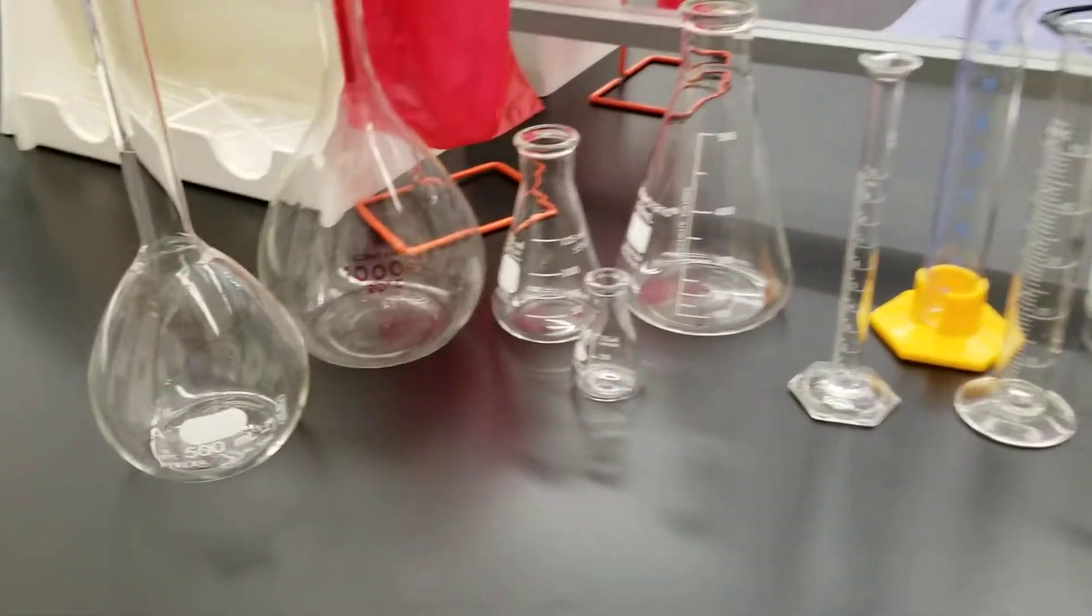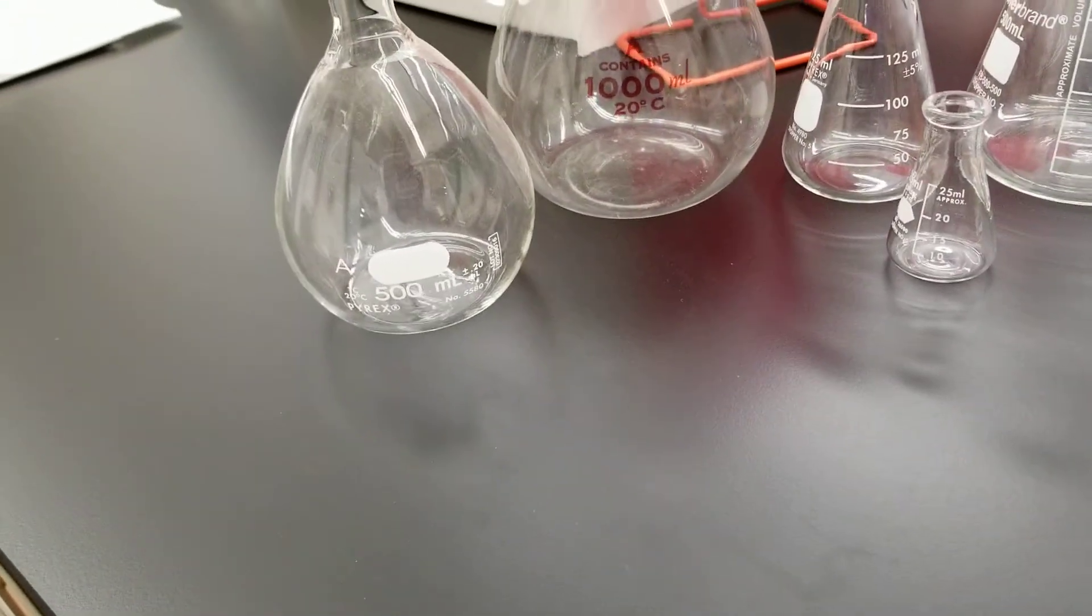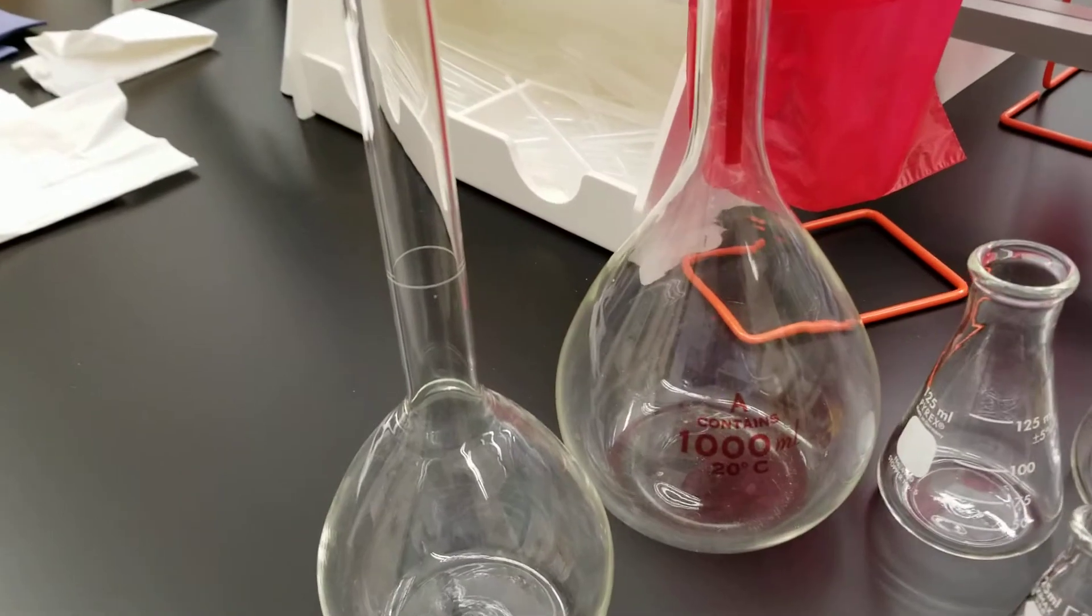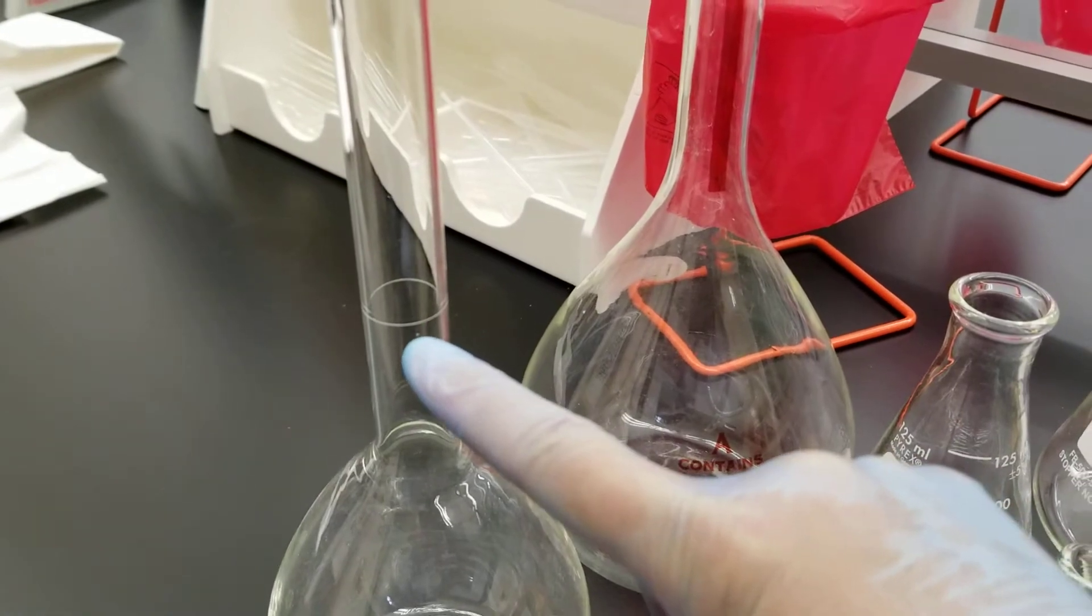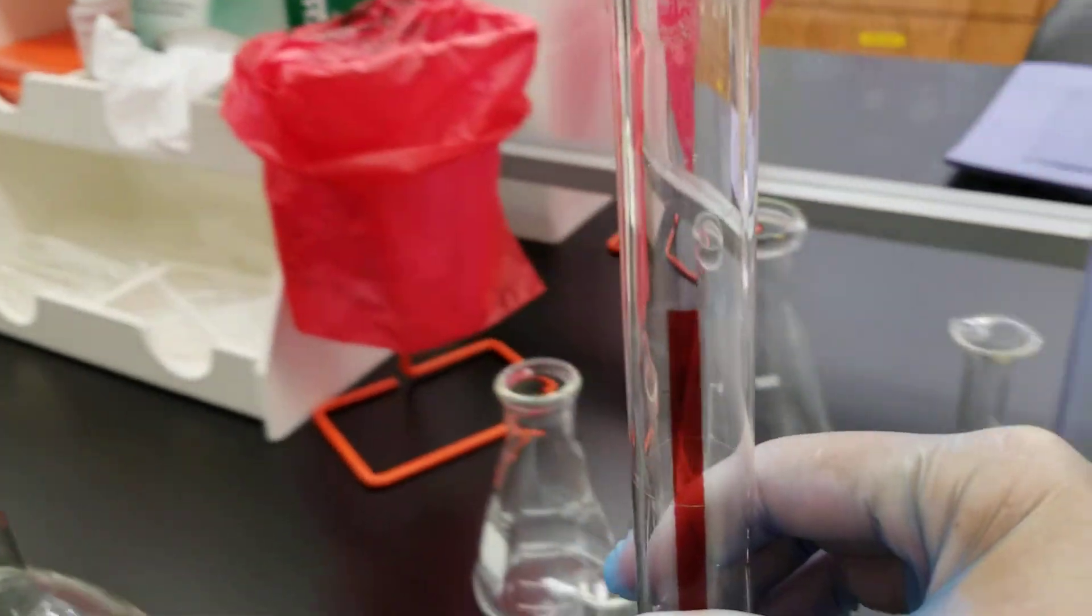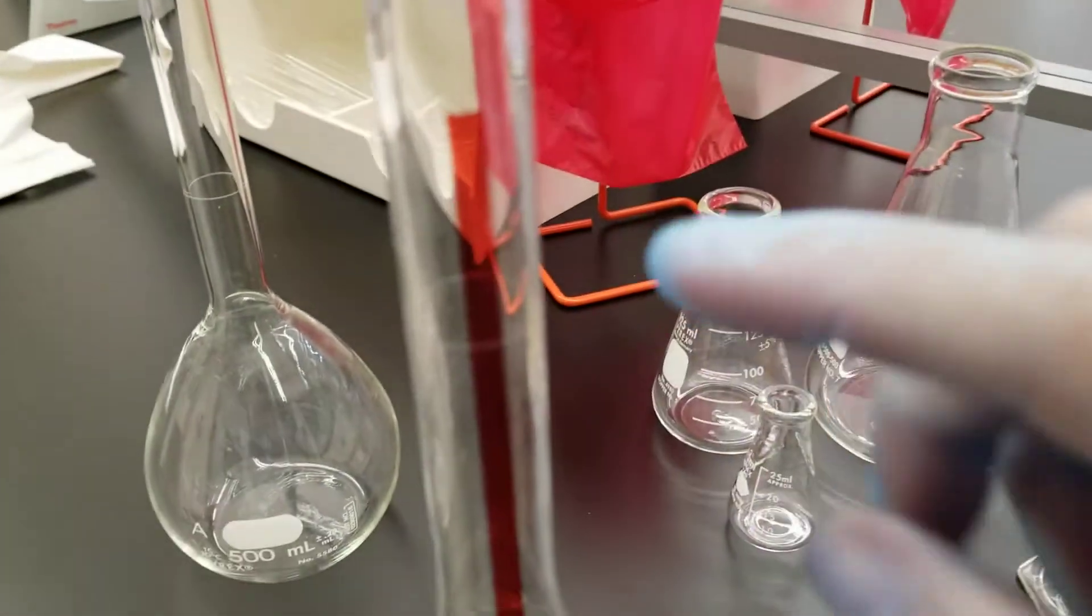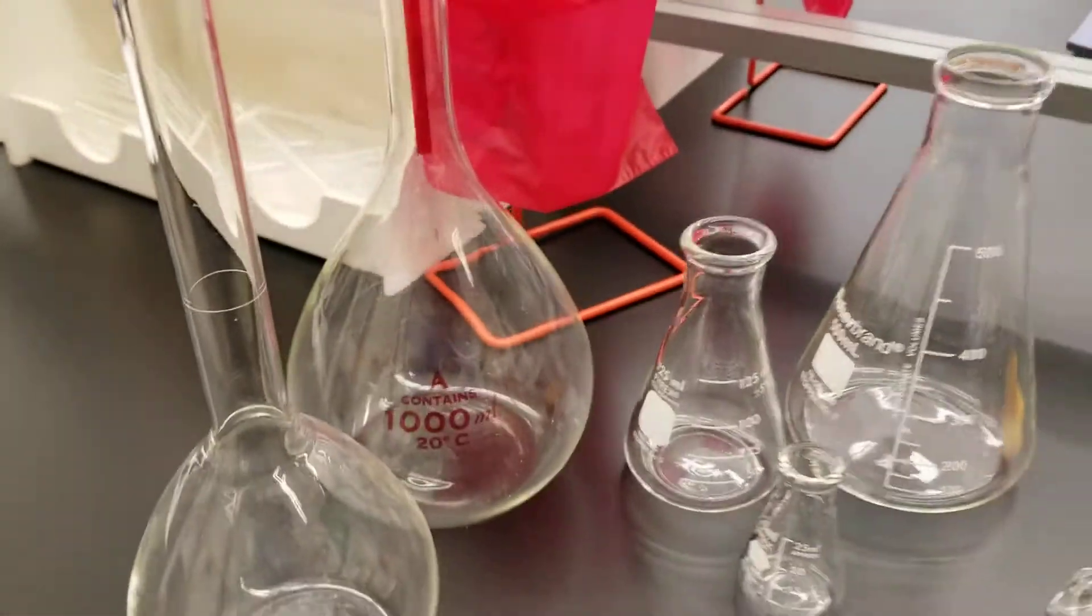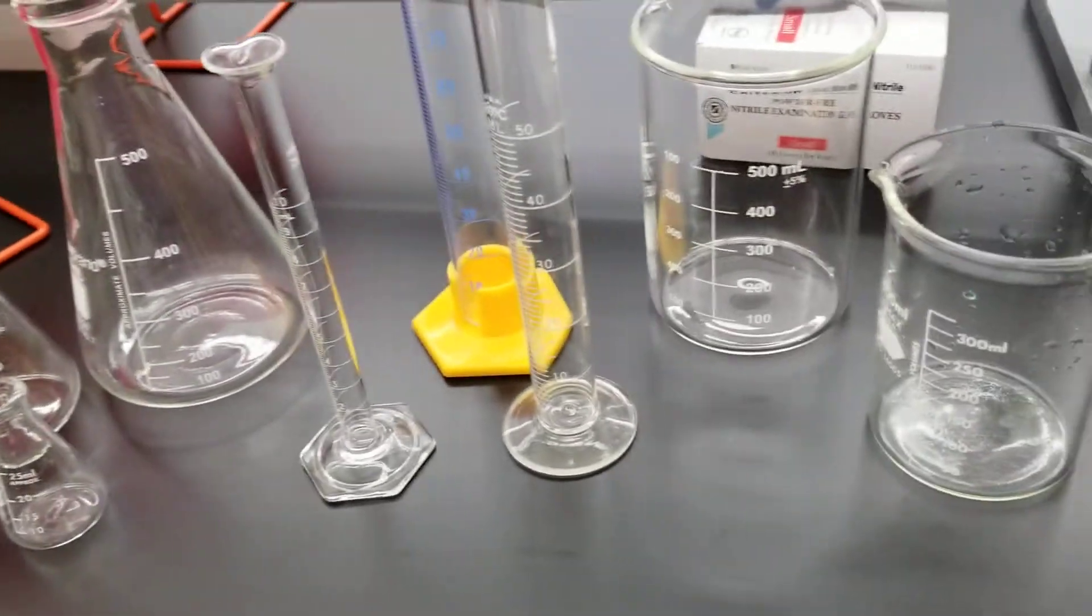So on the left here, you see volumetric flasks. These are used in creating some kind of standard or reagent where you need high accuracy because they, like their volumetric pipette cousins, are only calibrated to one volume, as noted by that dash. So each of them has a dash, since this is red, you can see that line here. This line right here, that is where it's accurate up to. Anything outside that range would not be an accurate volume, whereas the rest of these items over here are graduated.